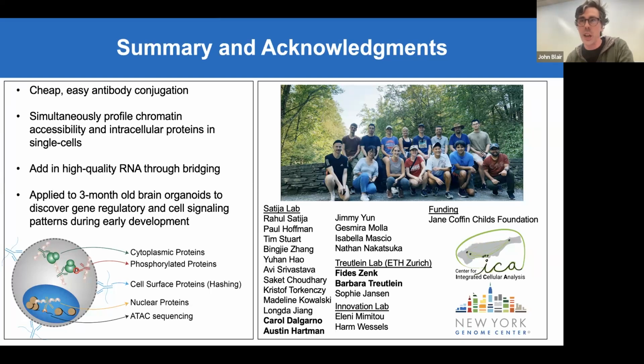Cell surface staining. Yeah. So all the cells in here are permeabilized, and we use a control that I didn't talk about to ensure that. What I do is I include just a little oligo that has no tag on it. And this is why you tend to have high background with intracellular protein without the single-stranded DNA binding protein: if you just put DNA into a permeabilized cell, it will just stick wherever because DNA is negatively charged and it will find some sort of positively charged pocket and just stick in there, and then you'll end up sequencing that. So the single-stranded DNA binding protein masks that signal, so that's why we can reduce the background.